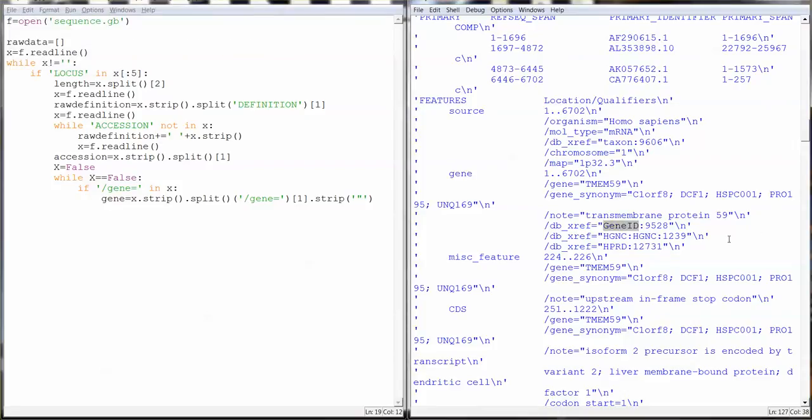Yeah, there it is. I'm interested in that, and instead of typing it, I have the code already. So I'm just going to show you what that looks like. So if gene ID in X, my Entrez ID is that ID. Entrez ID is for the gene. Each gene has one Entrez ID. So all the transcripts for this gene will have the same Entrez ID, but they will have different accession numbers and different transcript names.